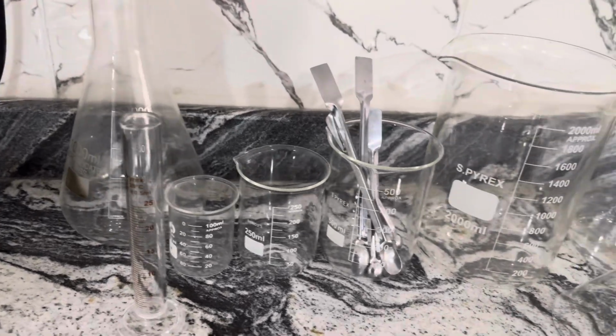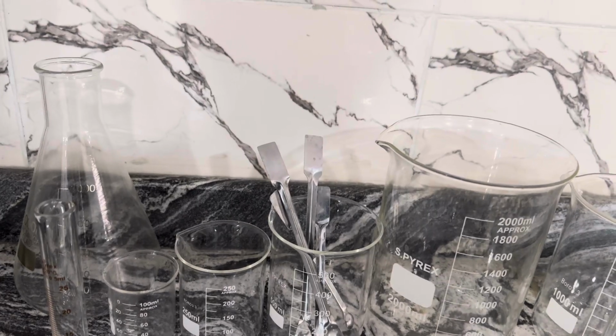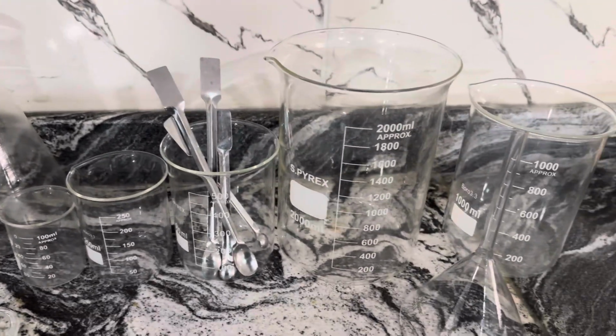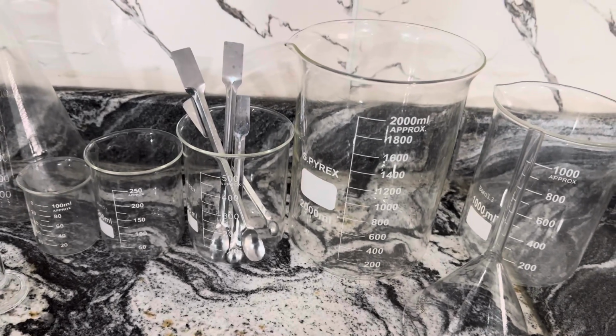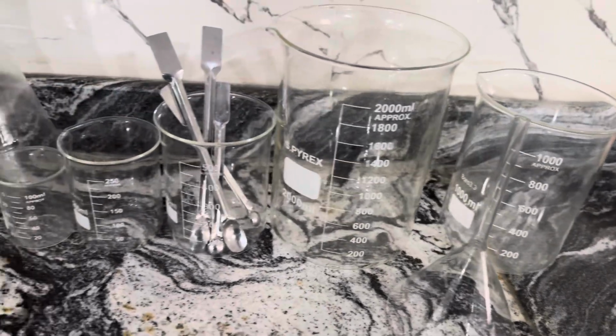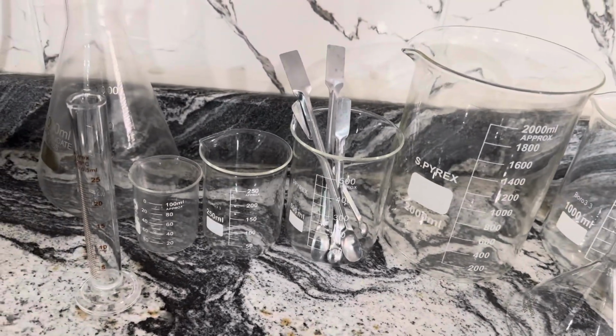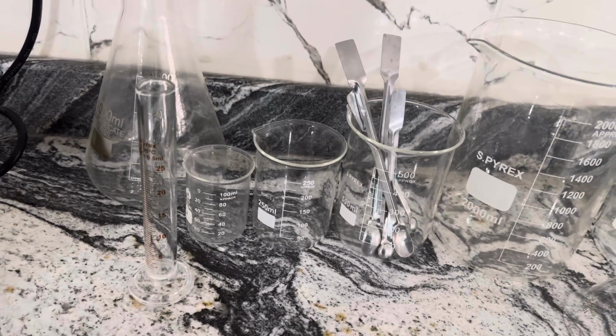As you can see, this is the beaker. In the lab we use the beaker for the mixing of different products. And the beaker can be 1000 ml, 2000 ml, 500 ml, 250 ml, 100 ml, and more is smaller than that.